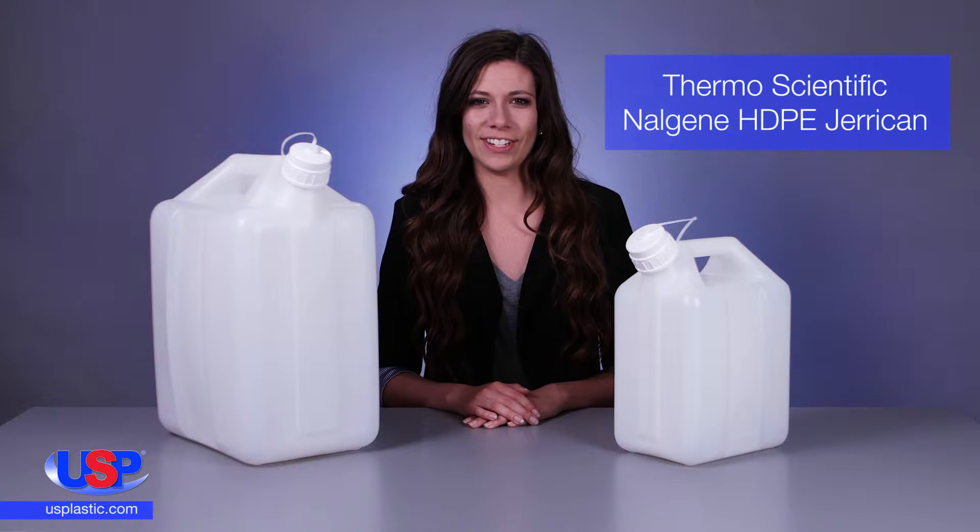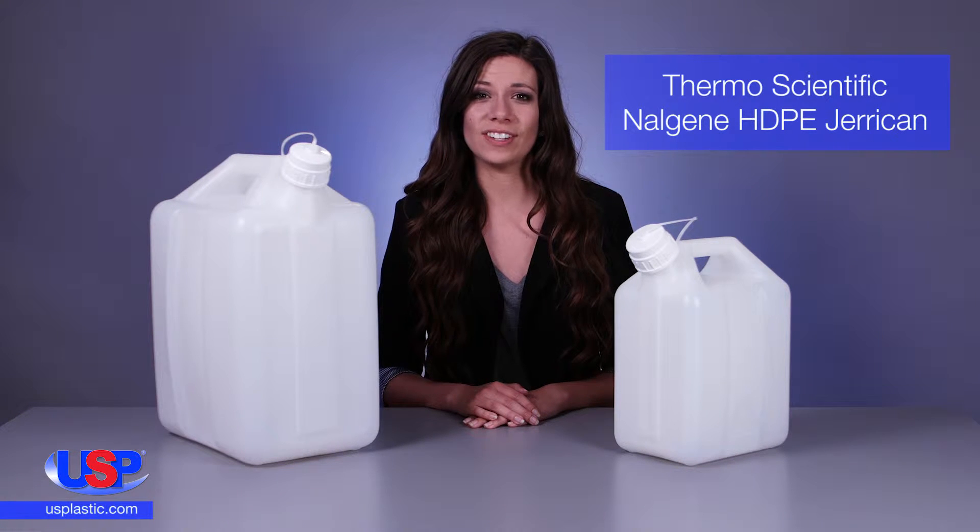At U.S. Plastic, we carry a wide variety of jerry cans, which provide an efficient way to store and dispense liquid.